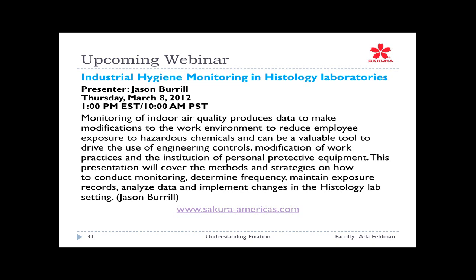Are we talking about biopsies? Are we talking about surgicals? Are we talking about hippopotamus? And I'm not joking on that. It depends upon the specimen and your processor, so there's not one thing across the board. This particular attendee is referring to small colon biopsies.